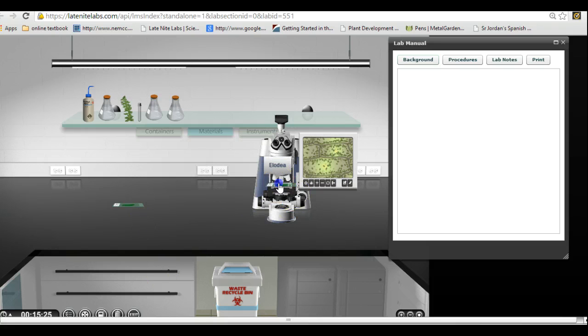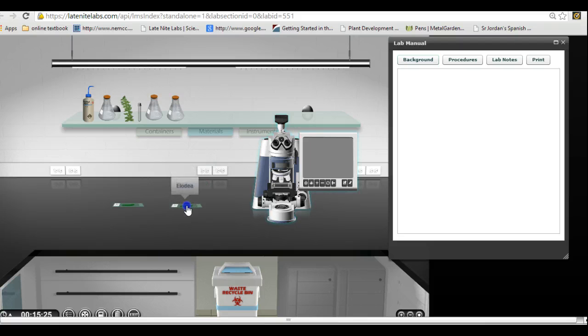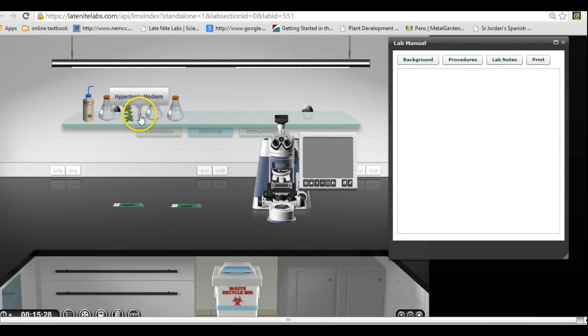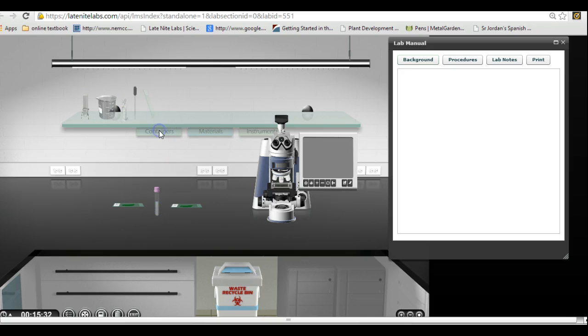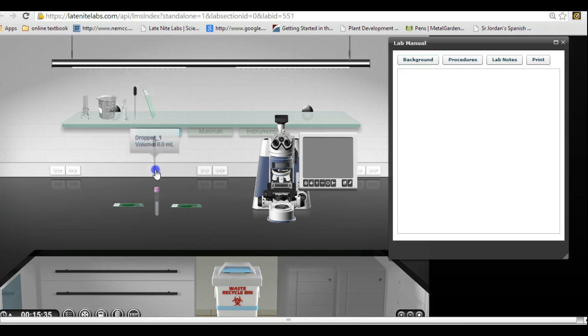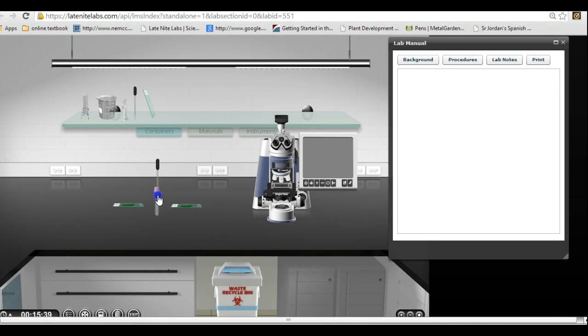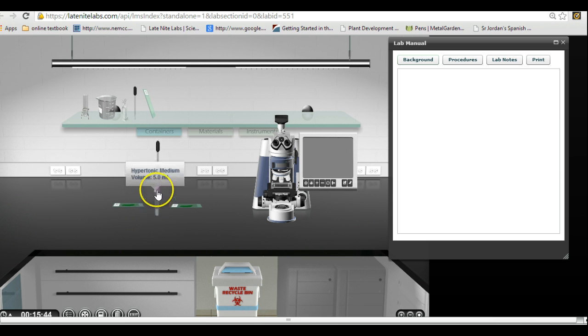Now I'm going to take this off, put it down here. Here's my hypertonic medium. Set it down here. The instructions tell us to get the dropper, put the dropper over here. Notice that the hypertonic media is glowing when we get it in the right spot. So it pulls it up.